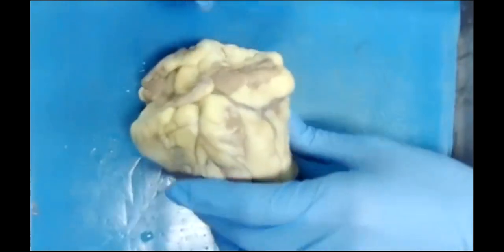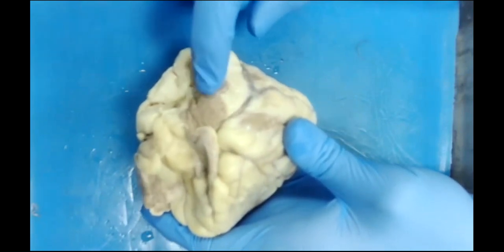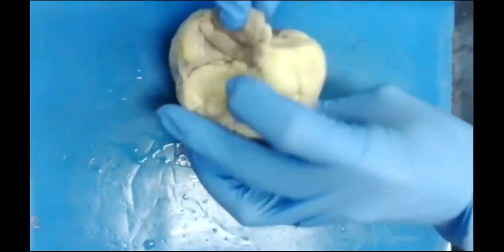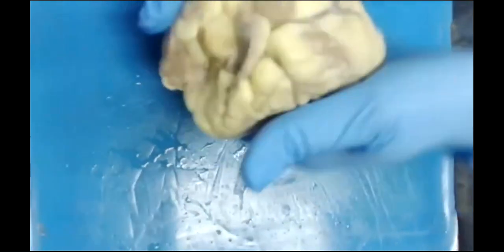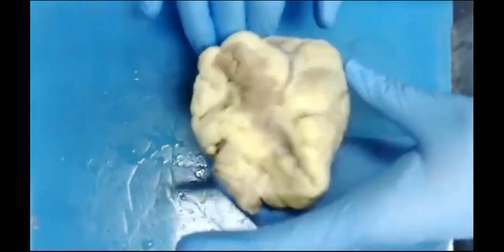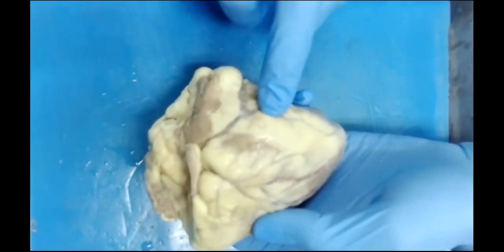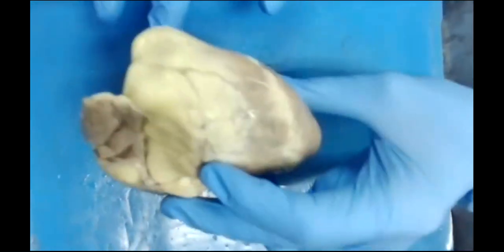Now, because this has been in a bag and it was compressed with a bunch of other hearts, its shape isn't quite perfect. Here we actually have our left auricle. Here we have our right one over here, but it's been twisted and torqued as things were moving around. So the shape is a little wonky, but we can see the apex of the heart here. We can also see our interventricular artery right here.